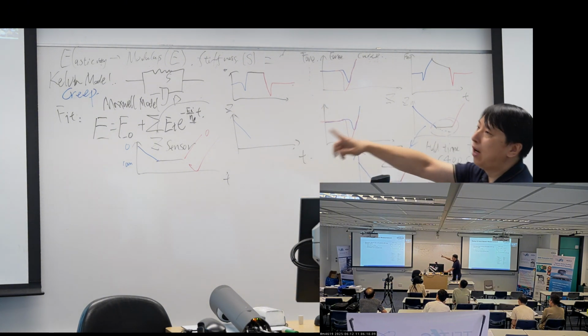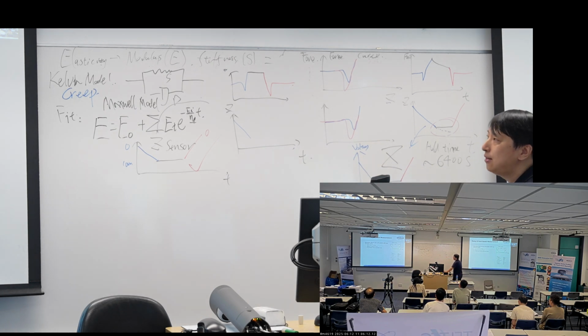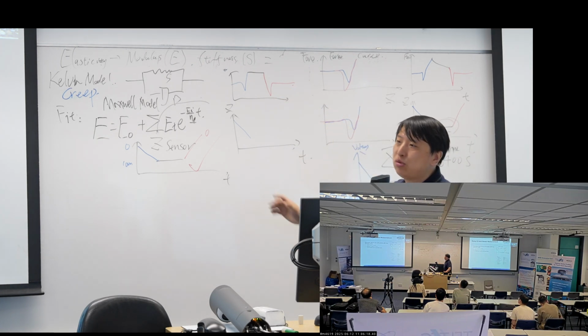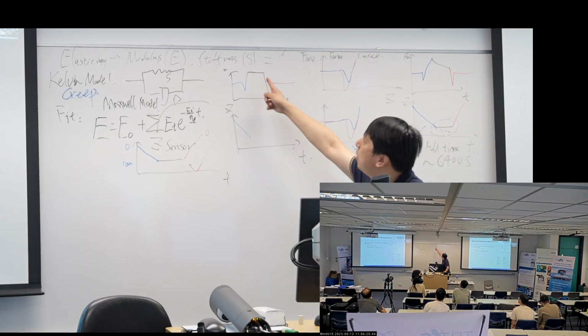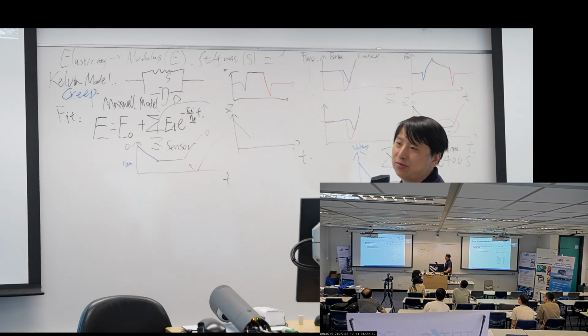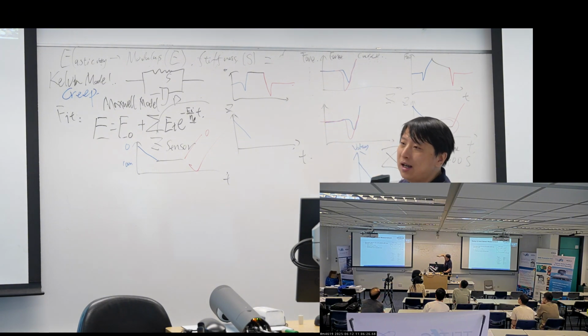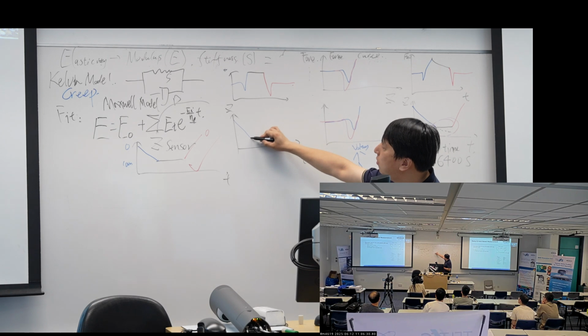Since my sample has viscoelasticity, its modulus will change. For example, if my sample becomes softer, you want to still hold this force. You want the sample to still have this force applied. I need to compress more. So usually the Z will be going down.